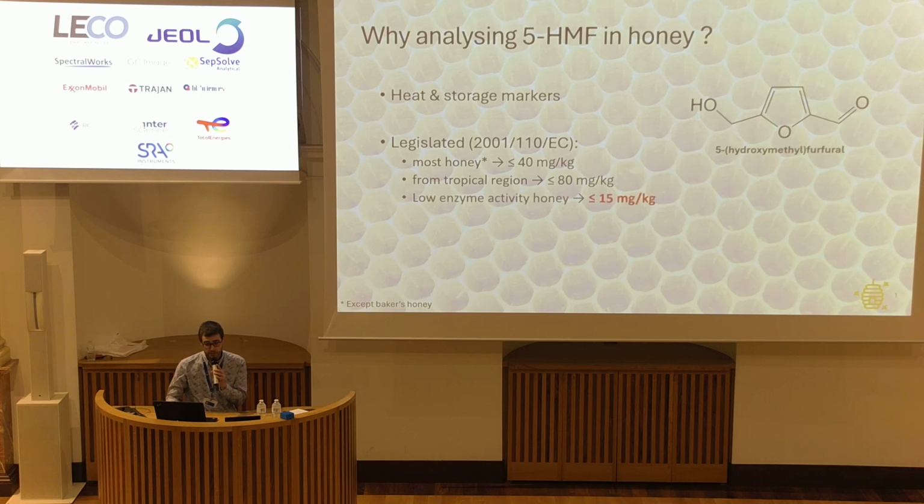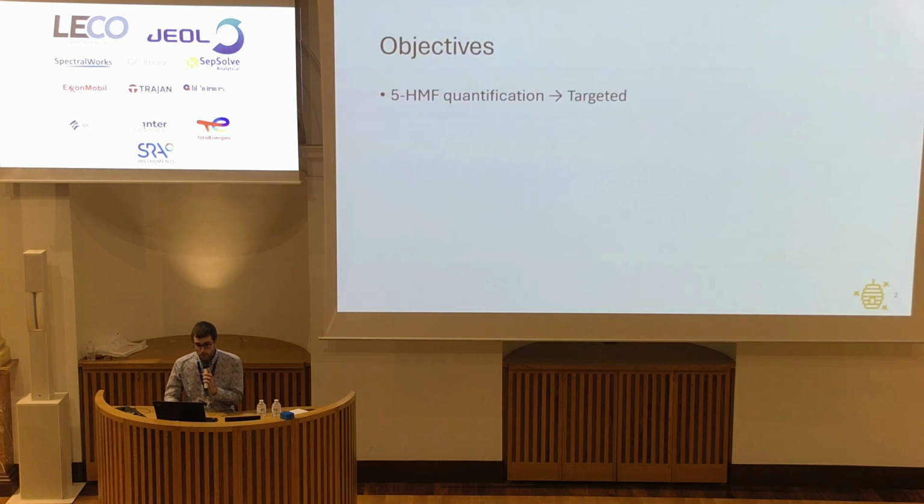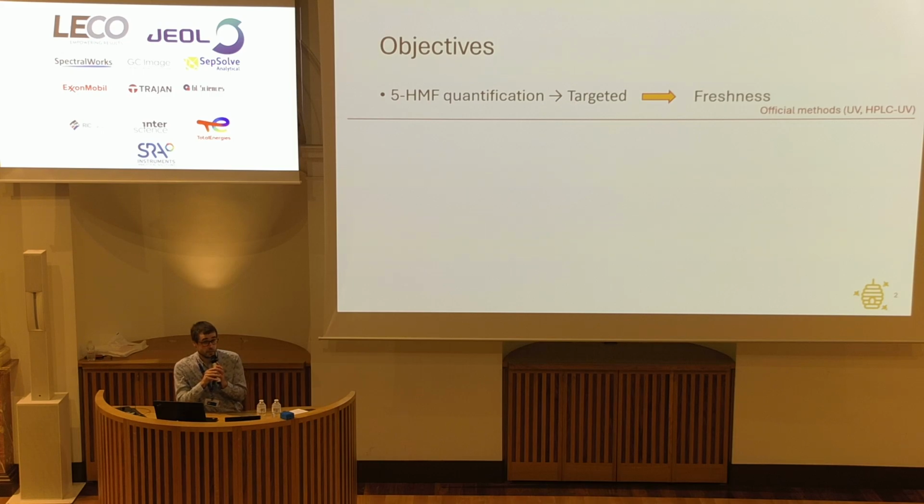But European legislation also has a limit of 15 milligrams per kilo for low enzyme activity honey, such as thyme honey. So all in all, that means that we have to develop analytical methods that can reach these limits. So our first objective is to develop this targeted method to assess the freshness. So you can say, okay, that's really great. It's kind of boring because we already have this through the official method.